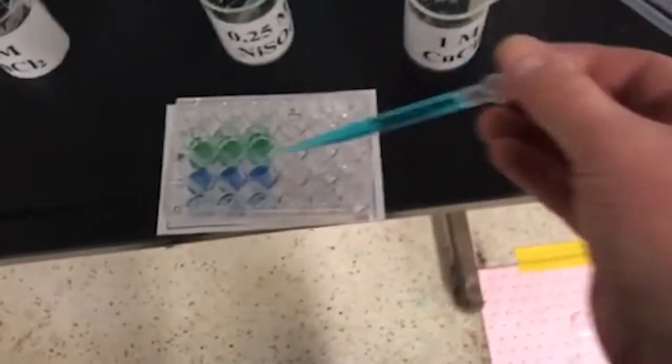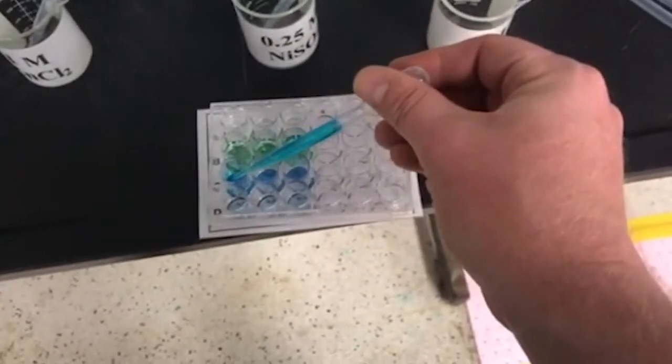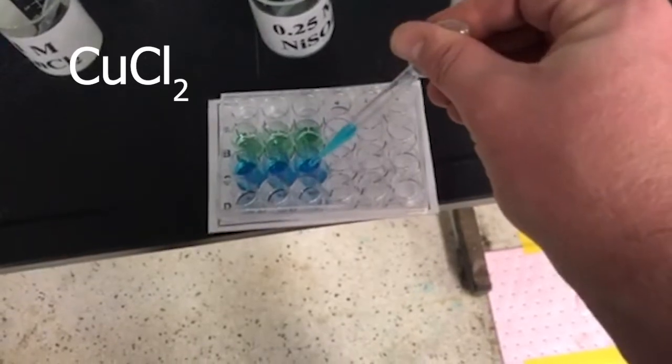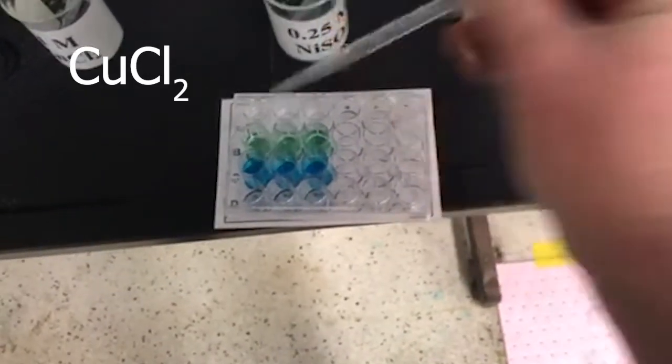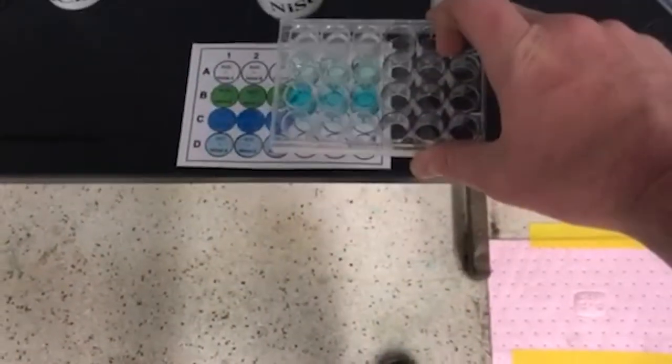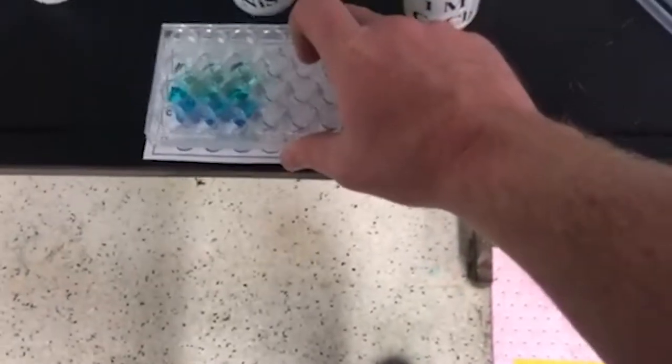I've got about 3 milliliters of my nickel sulfate solution, 1 milliliter into each one of these. We are good. Last but certainly not least, the copper chloride solution. There we go. We've got our 3 solutions lined up. Perfect. The colors match and everything like that.